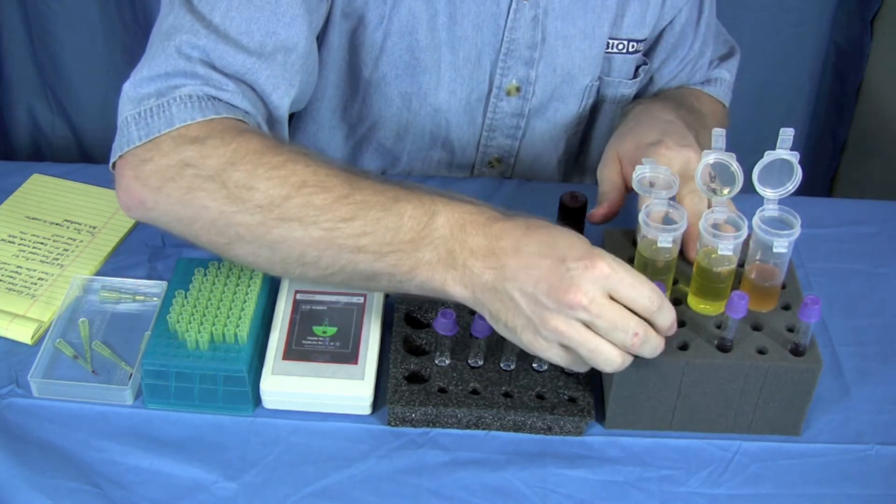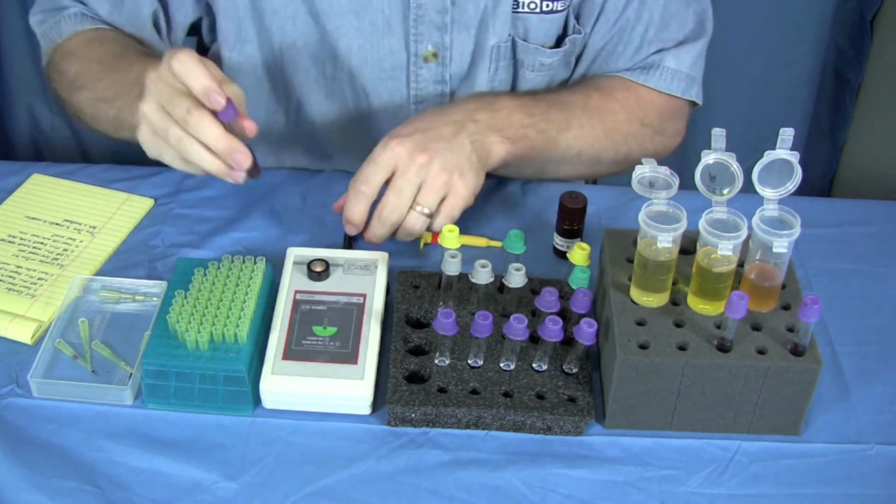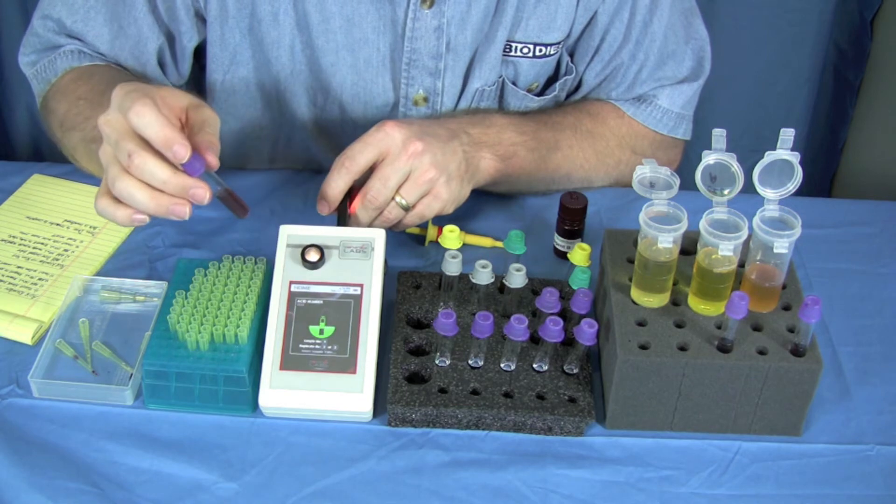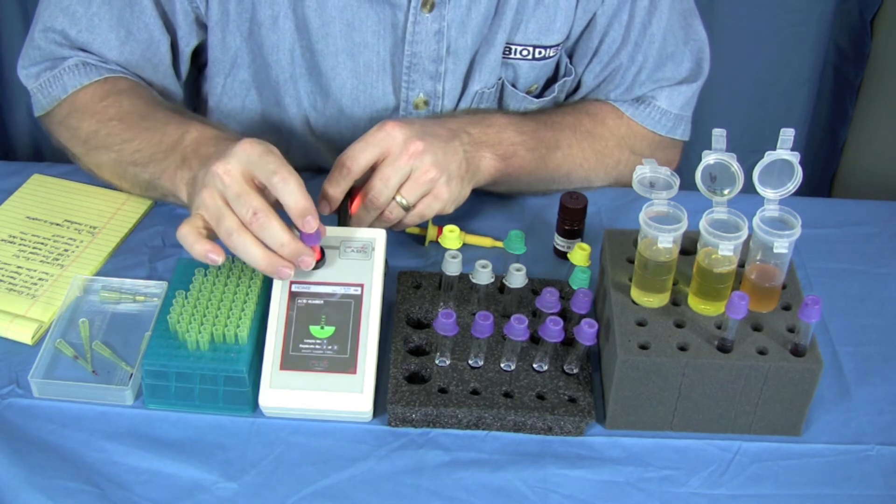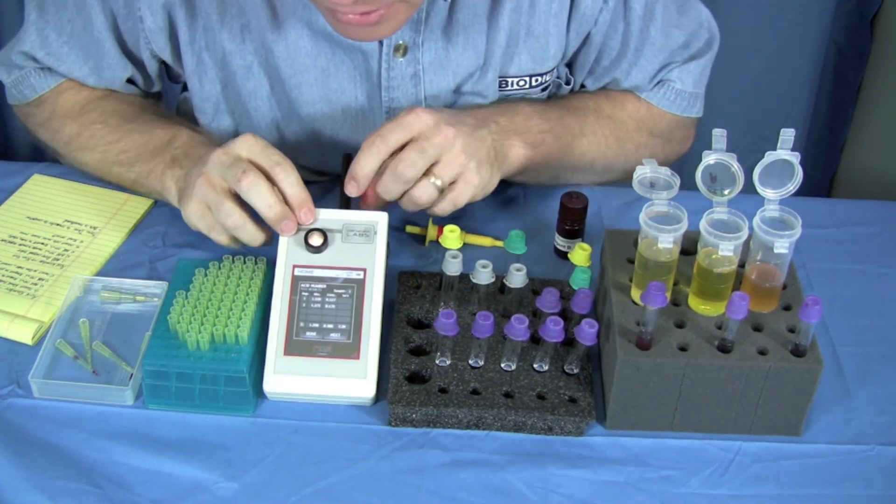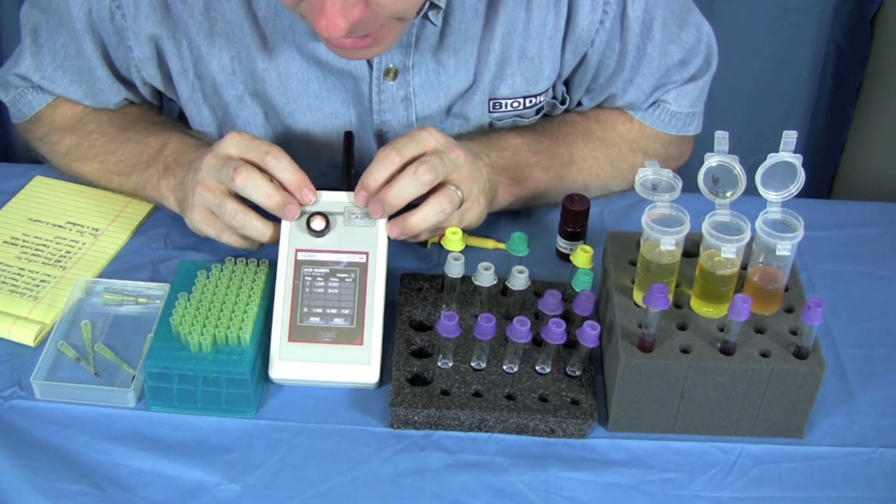We'll test our oil sample B first. Shake these fairly vigorously. Put it into the machine, it's all ready to test. Pull that out. It's going to ask us to put it in twice. Its acid number was 0.5.